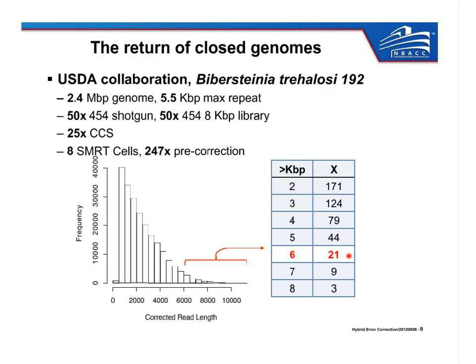Let me just jump to another assembly alignment question that came in. If we can use MUMmer to map reads, would something like Minimo be useful for assembly? Have you done a comparison of Minimo versus Mira versus the Celera Assembler and or others? Yes, certainly. So Minimo is an implementation of the unitigging approach, which essentially is what Celera Assembler is doing. However, the implementation of Minimus and these other AMOS packages is done in such a way that it's not efficient for really large whole genomes.